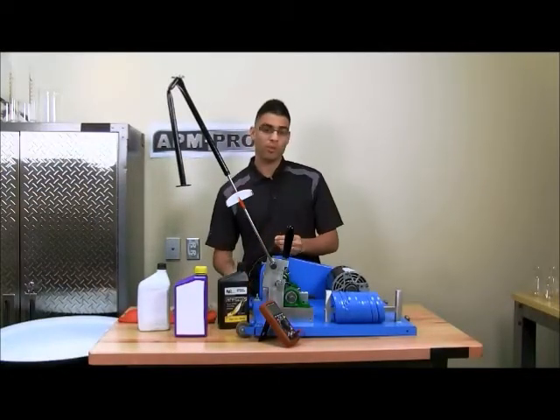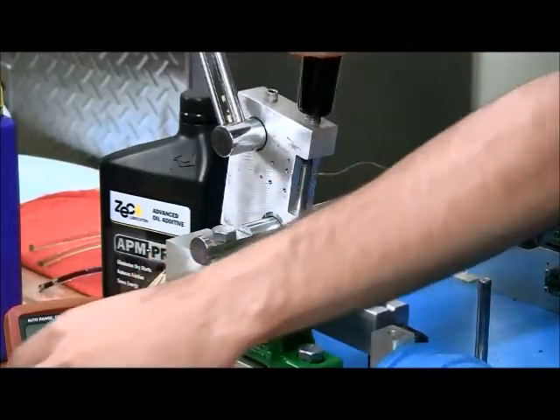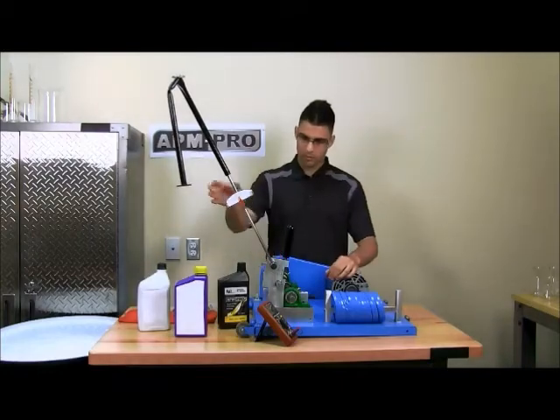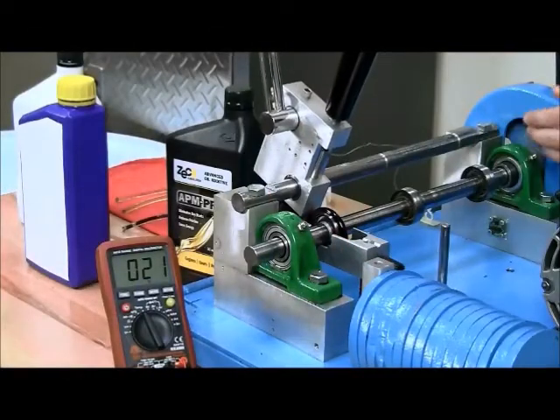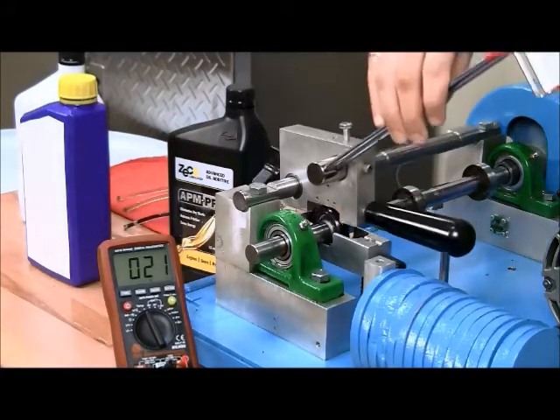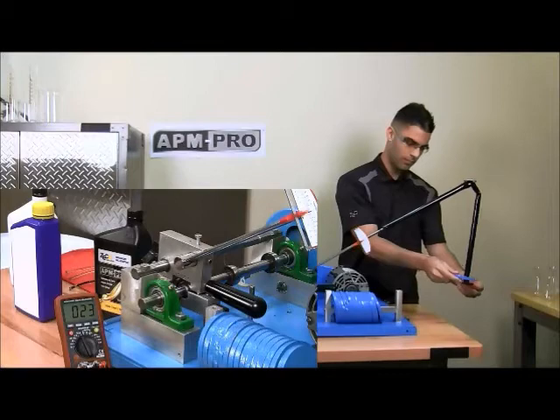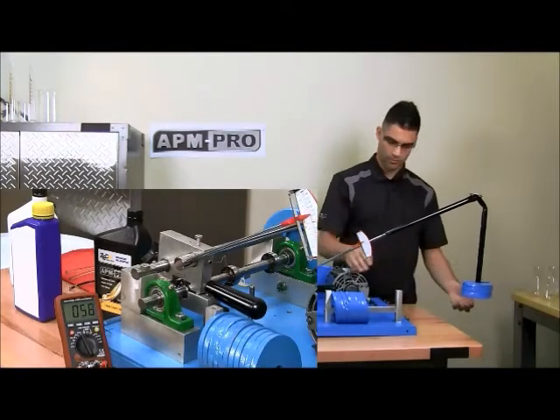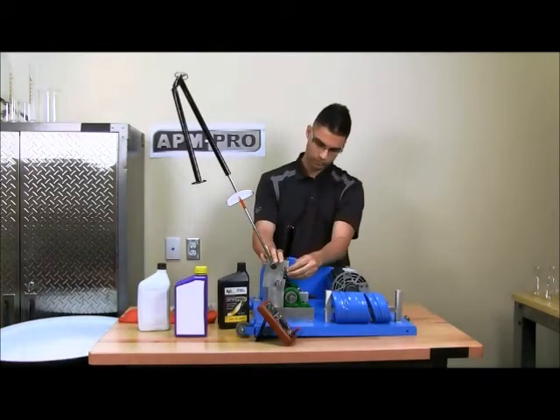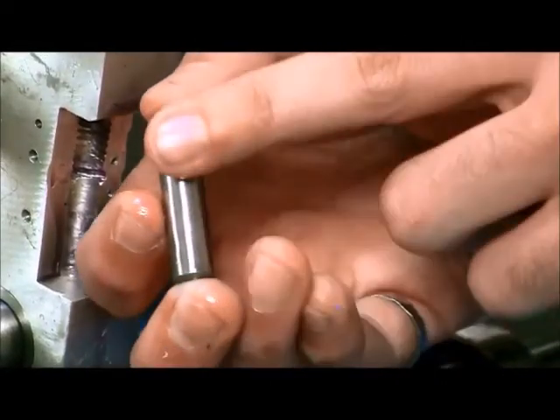We will also show the temperature at the pin. As you can see, the race picks up the oil. It stopped at five weights. You can see that the pin has a pretty big scar.